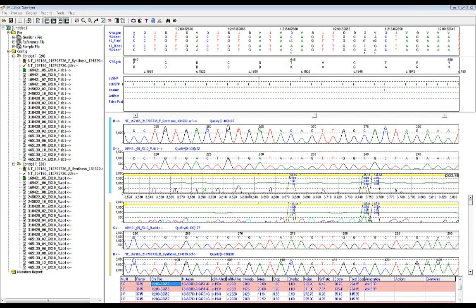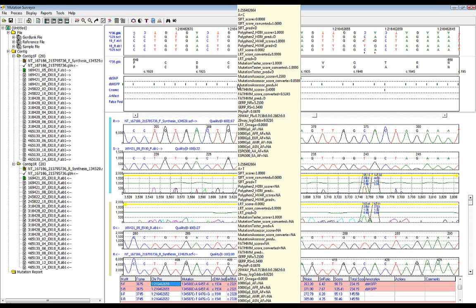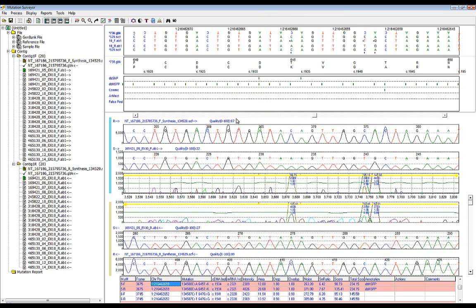To monitor database annotation in the sample trace, Mutation Surveyor has also added a track pane at the top of the screen directly under the amino acid pane. This pane highlights positions of clinical significance by placing a green tick mark at chromosome positions where there is annotation. To view additional information associated with the position, you may move the mouse cursor over a tick mark to bring up an annotation box. Each tick mark lists relevant information for that database, such as the mutation, cosmic ID, dbSNP number, and dbNSFP information such as functional prediction, conservation, and population frequency scores. If you'd like to hide any of the databases from the track pane, simply right-click and uncheck a database.